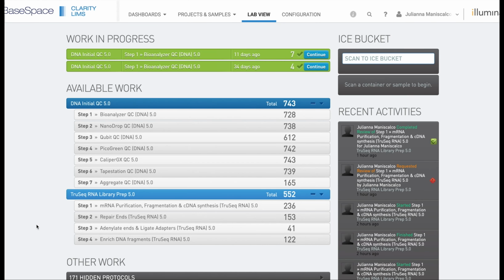In this video, we are going to review how to use the out-of-the-box reagent validation feature. In Clarity LIMS, reagent refers to the different kits that can be used in a library prep. The out-of-the-box feature ensures that you are using a kit that is active and not expired.